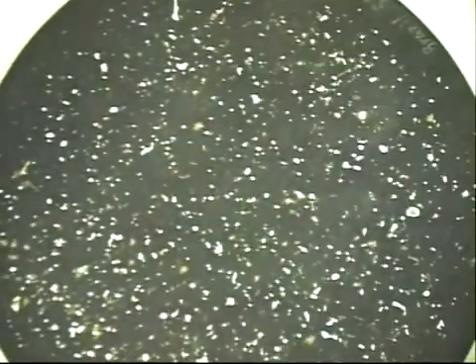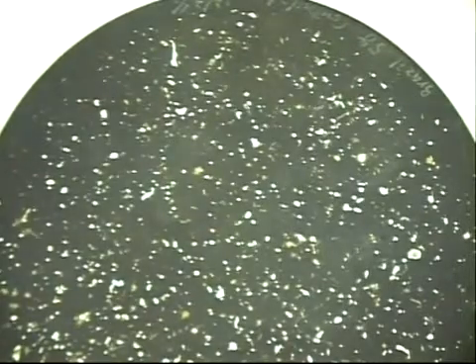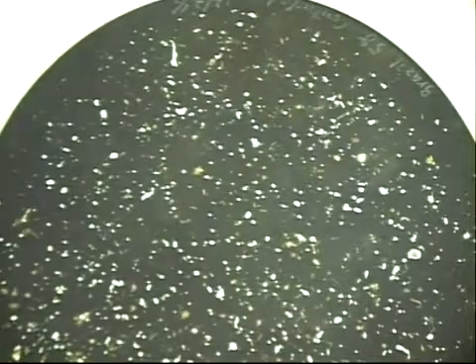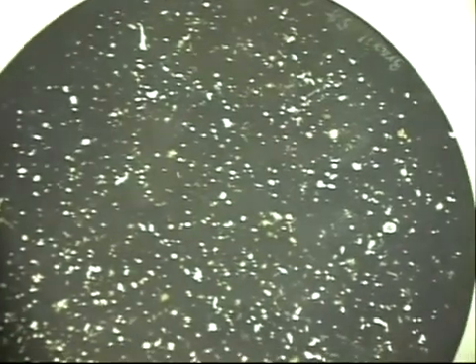I should put these on the scanner and show you there. But in any case, this has been processed through the Carver press and using the Voith paper to activate the stickies and identify the stickies as separate from the other tramp materials that came with the process.